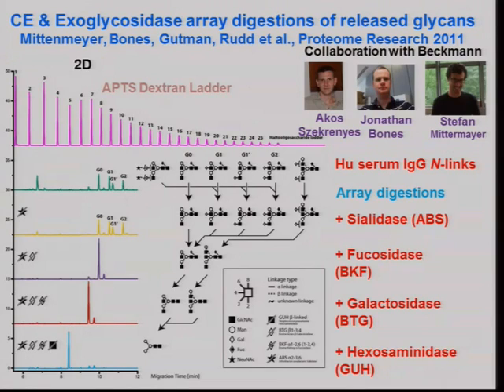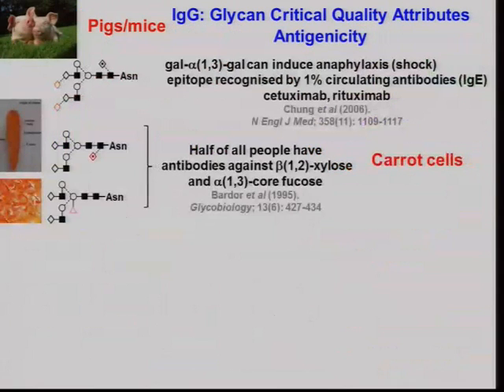For example, if you want to look for alpha-gal, you can use coffee bean galactosidase. It's one digest, and you can get the quantitation. If you try to do it by mass spectrometry, you probably won't see it because it's a very small amount, and you don't get quantitation, and it's just messy. So there are really good reasons to use these enzymes. And now New England Biolabs have made them. They're so much better quality. You shouldn't have any issues really. I'm just making sure that you know the snags as well. I'm not trying to tell you everything's rosy, just things you need to be aware of.